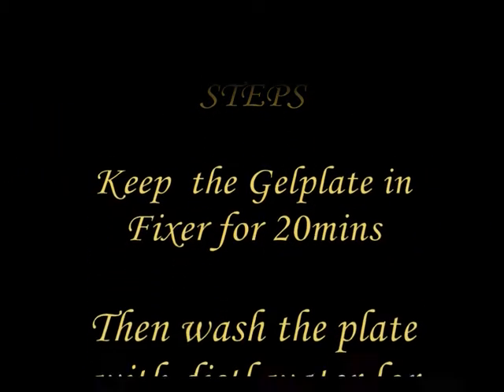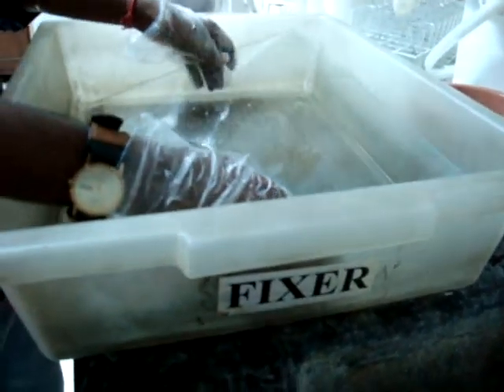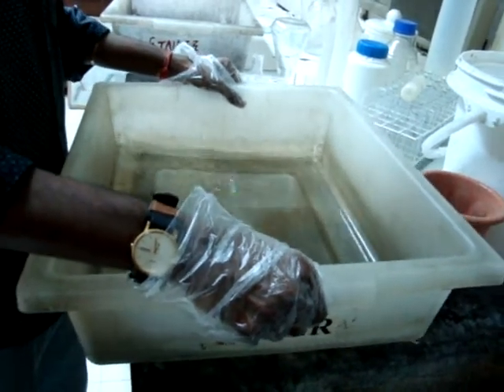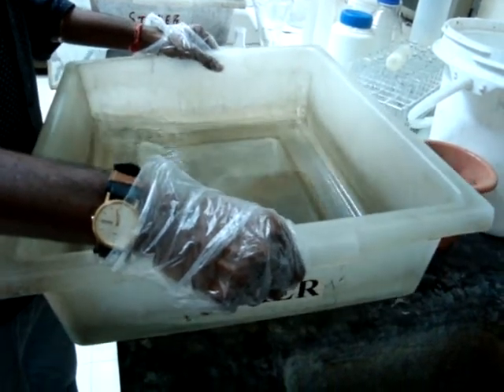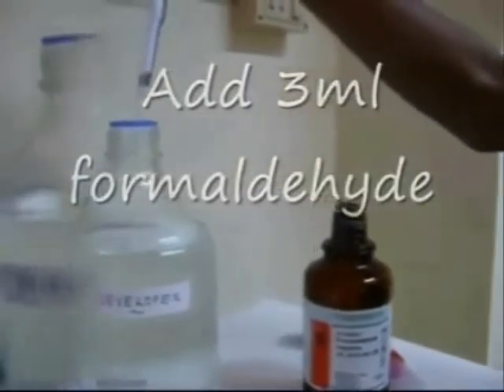The following are the steps involved in the silver staining process. Place the gel plate in fixer solution for 20 minutes — this is the first step. Then wash the plate with distilled water for 10 minutes. Keep the gel plate in the staining solution for 30 minutes; since it is a photosensitive process, do this in a dark place. After that, add 3 mL of formaldehyde and 400 µL of STS to the developer solution. Before placing the gel plate in the developer solution, do a quick wash with distilled water, then place the gel plate in developer solution and gently shake it until the bands appear.